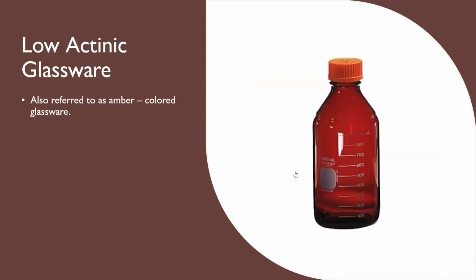Next in line is we have our low actinic glassware. This is sometimes referred to as the amber bottle. You're familiar with this one, okay? This is the amber bottle that is used in the clinical laboratory. Example of a chemical that can be seen in an amber bottle is your sulfuric acid.